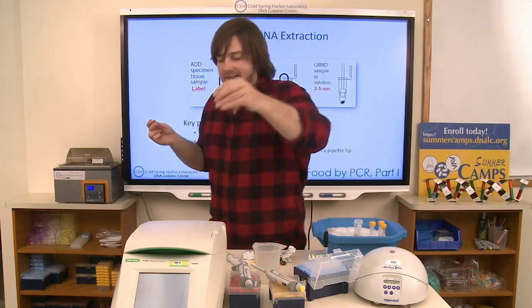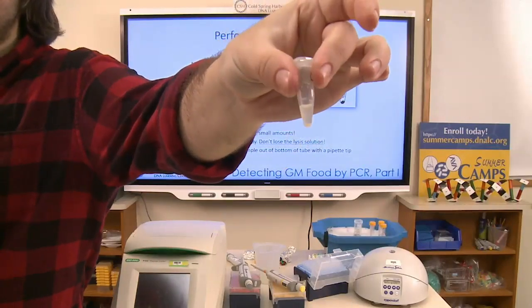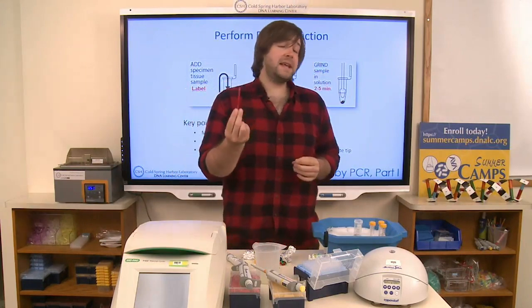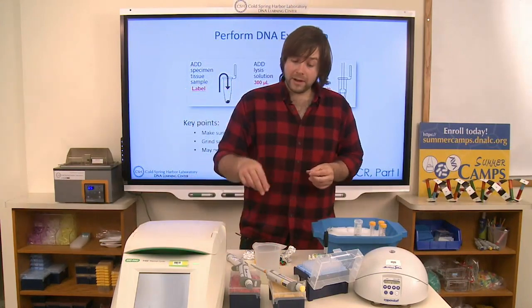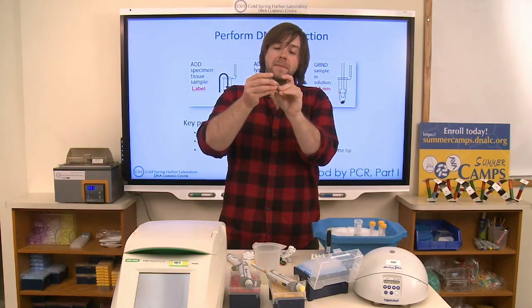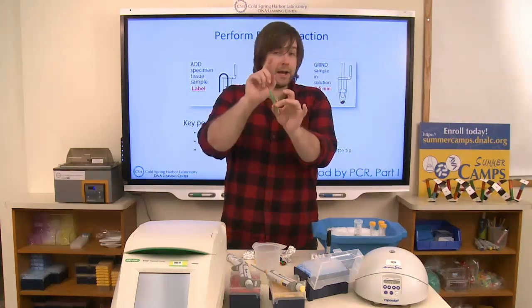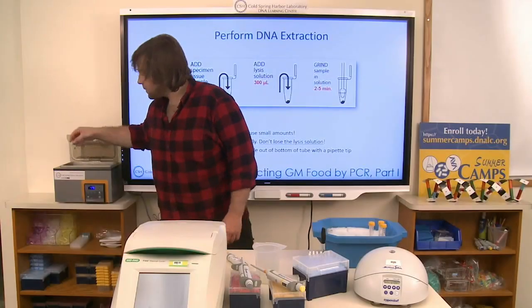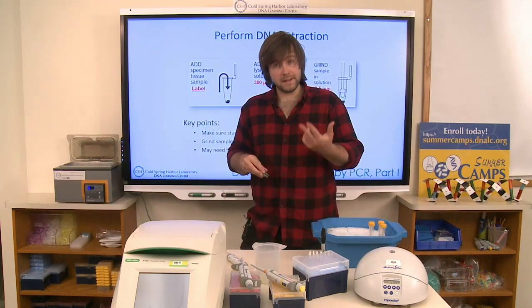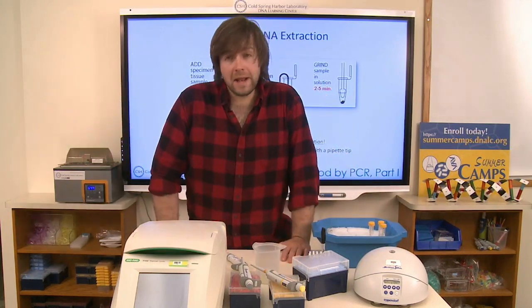There you go — we have a nice cloudy solution. There's still a little bit of solid at the bottom, but that's okay. We're going to put that into the heat bath. I've used the pestle on my organic corn chip, and I won't use the same pestle for multiple samples, so I'll grab a fresh one for each. I'll spare you the thorough entertainment of watching me grind all samples — check back in just a few minutes. Okay, I've ground up all four samples — the positive and negative control as well as the cheesy and organic corn chip — and I'm placing them in the heat bath for about 10 minutes.